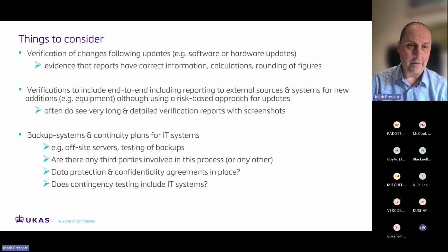In terms of backup systems, many laboratories might have off-site servers. You might see this especially in a private laboratory or private service that has its own IT department, or they may contract out the IT services to another provider. So do ask about how backup works, things like mirrored servers. I never fully understand what a mirrored server is, but really have a look at how you back up your data so you don't lose anything.